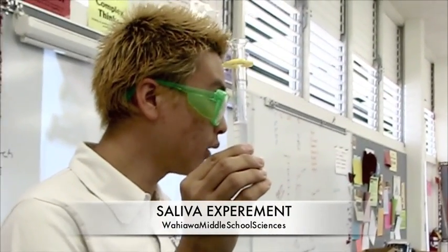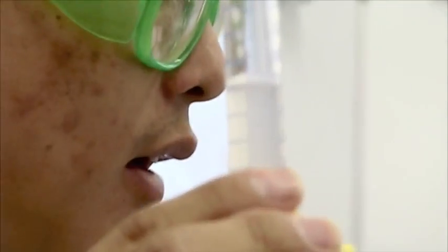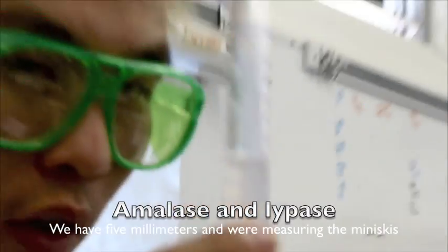So this is Chase's saliva. What enzymes are in here again? Amylase. Amylase and? Lipase. Very good.